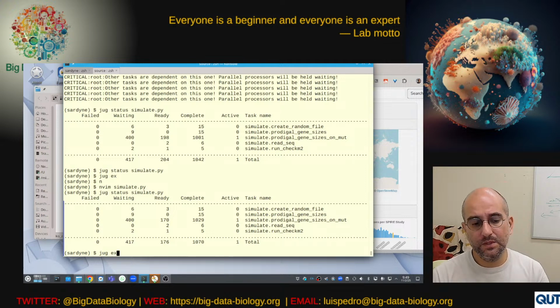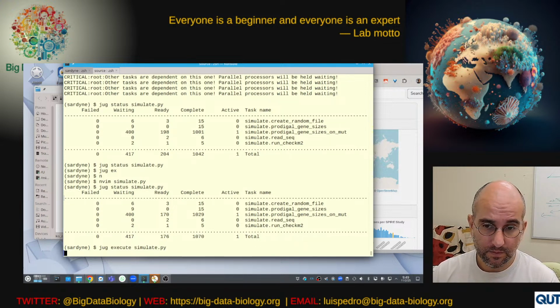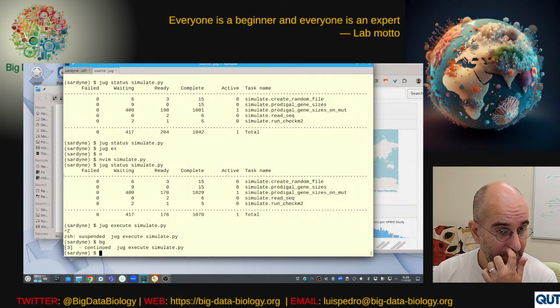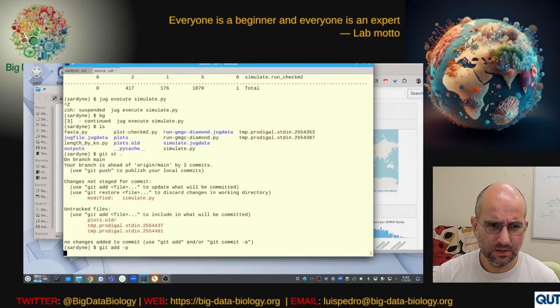So obviously this would also be a huge issue for processing the MAGs, because the MAGs are going to be heavily fragmented. Okay, but let's do it this way.